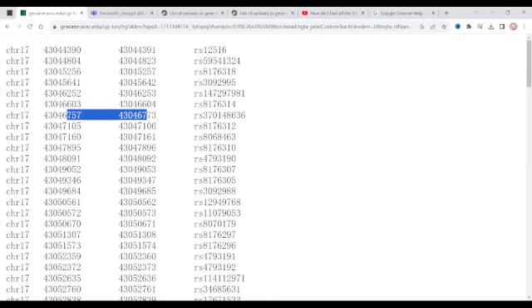So in bioinformatics, this is very important, how you see the logic. You got the 280 common. If you carefully look at it, it's actually not the same.